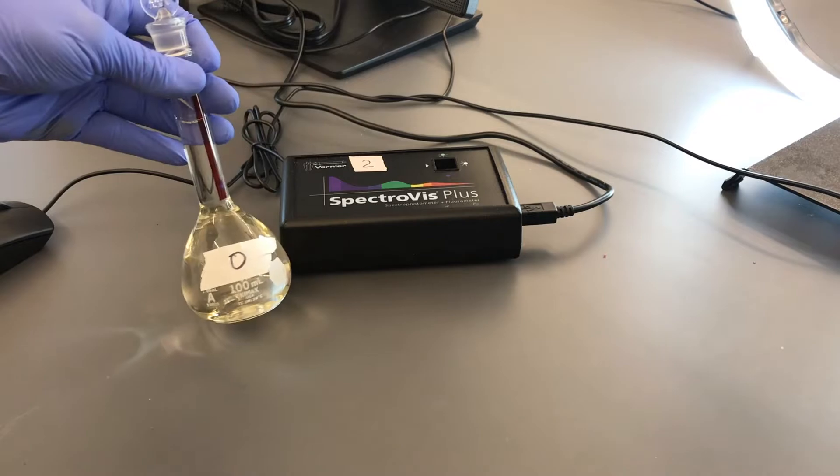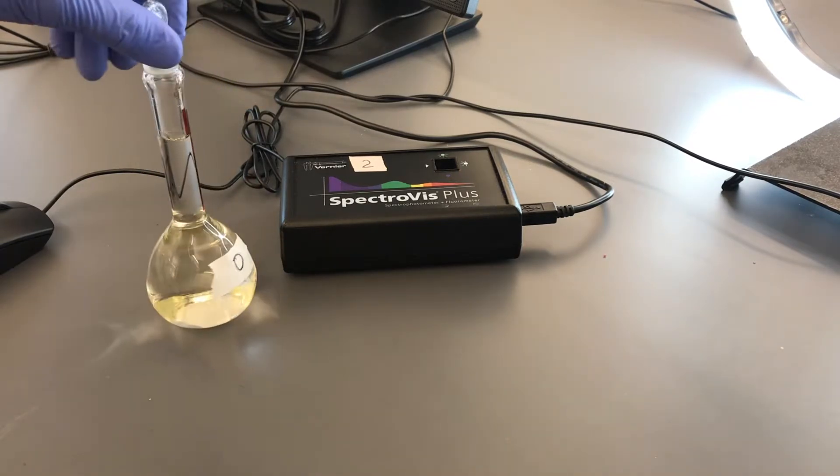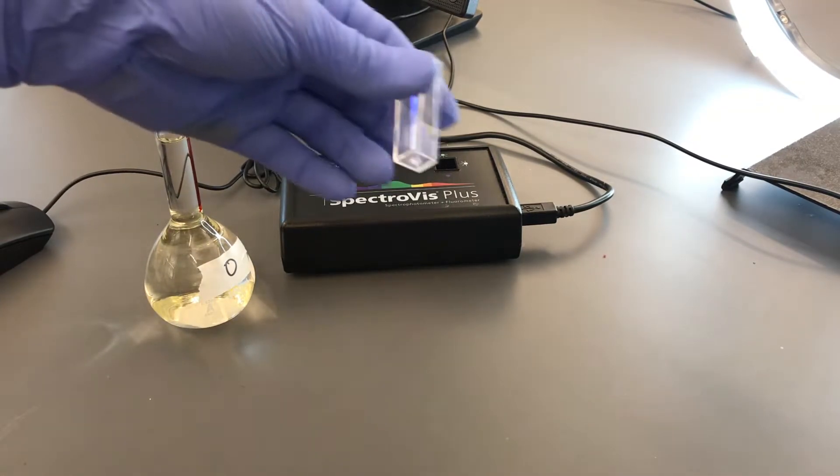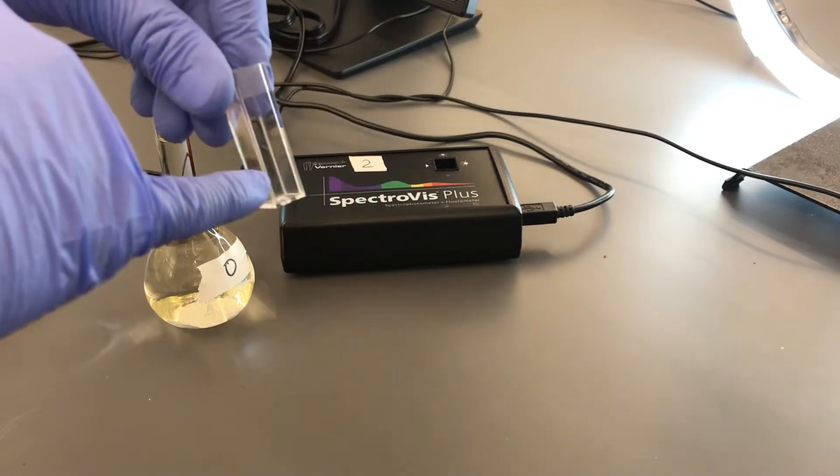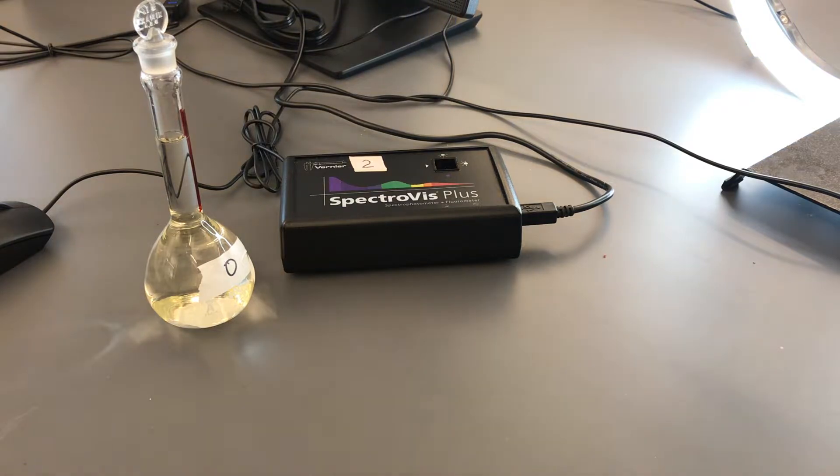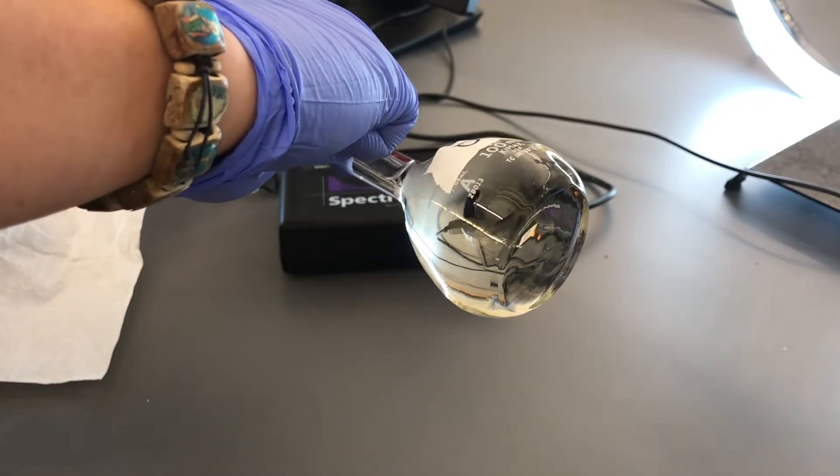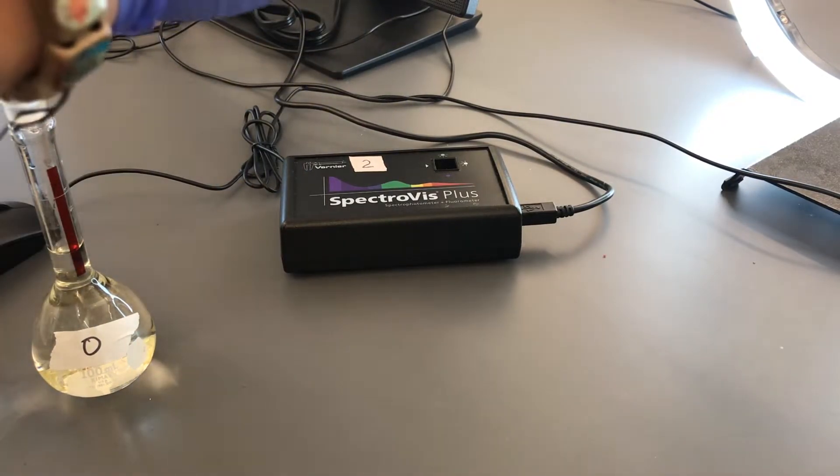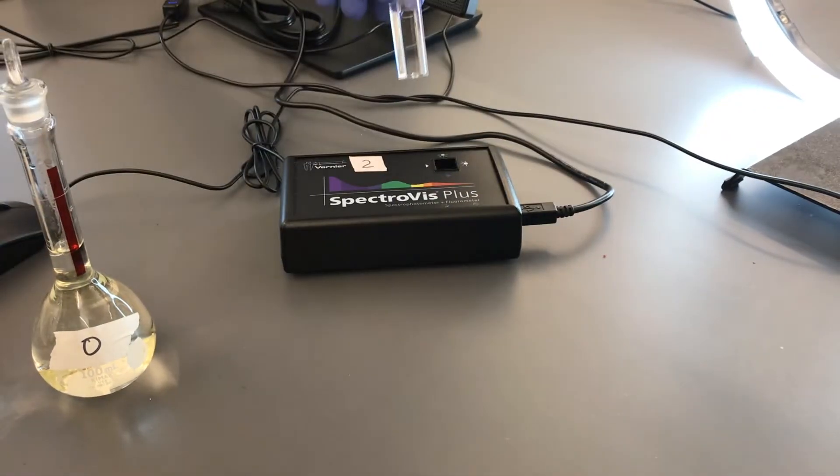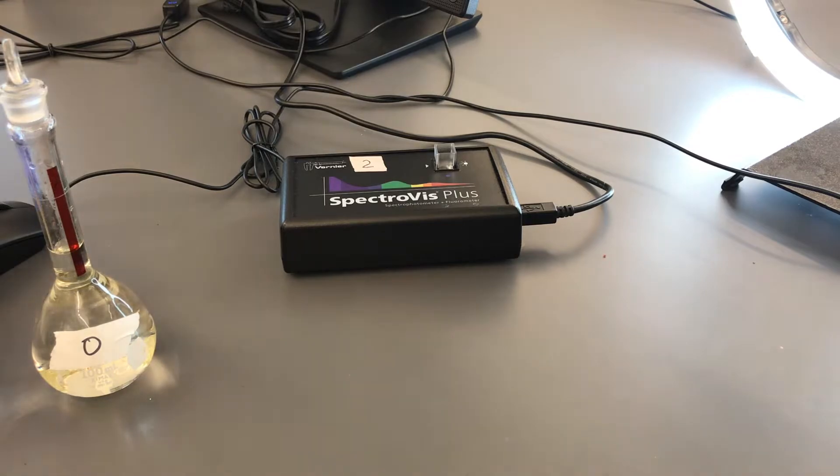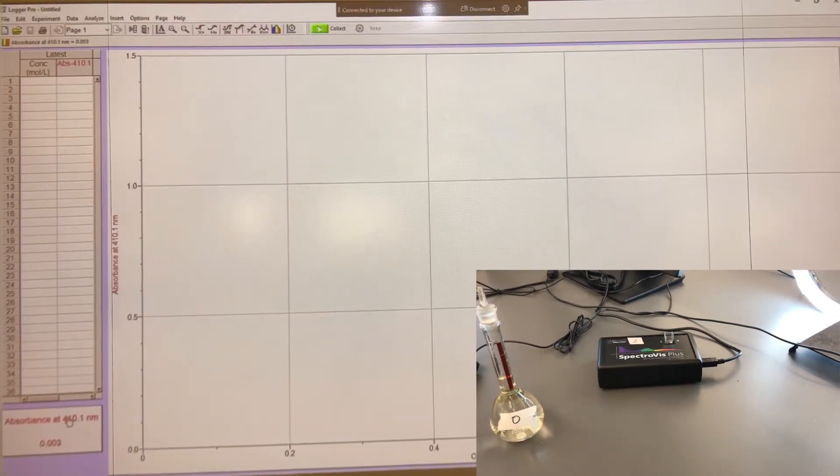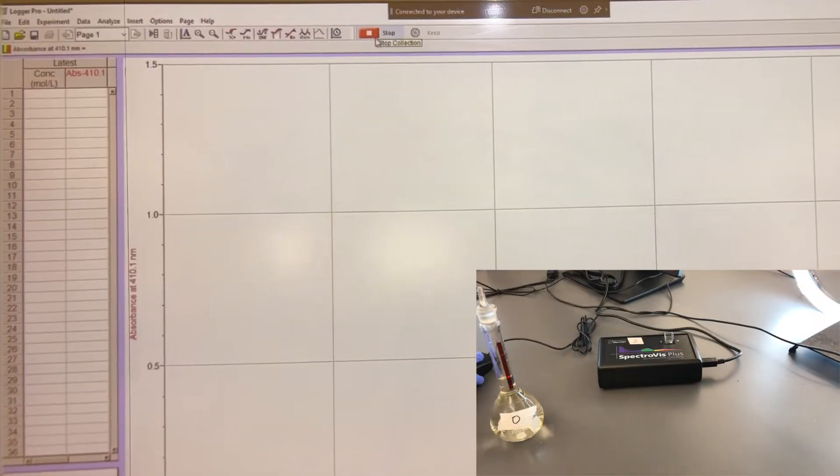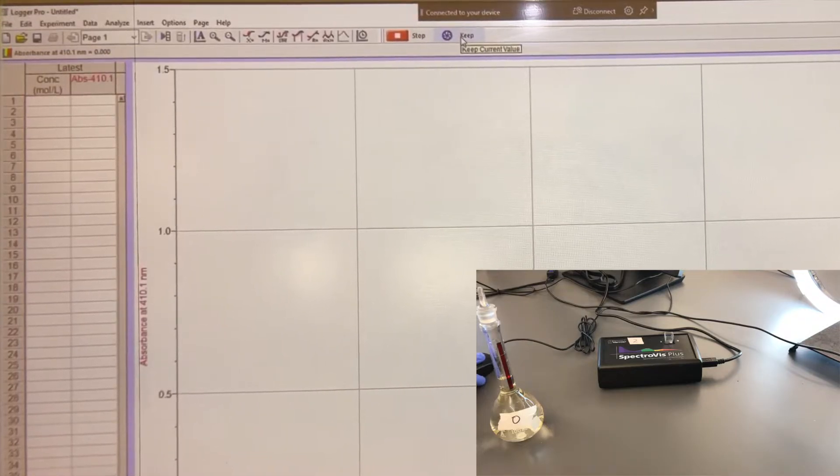It's asking us to put a blank in there. And we've got to finish the calibration. As you recall, we're going to use our number 0, the one that doesn't have any sodium thiocyanate in it, as our blank. We'll put that in our cuvette, which is this right here. We'll fill it up about 3 fourths of the way. We'll clean it with the Kim wipe and then insert it in there. And then we'll hit finish calibration. 0 is our blank. We'll use that as our first reading. So we can hit collect up here. And then we'll hit keep to keep our current value.